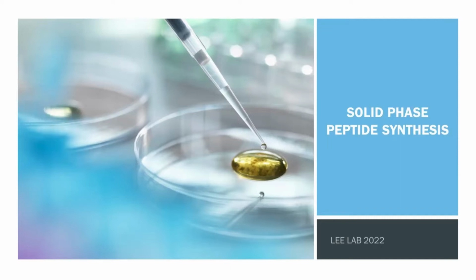Welcome to the solid phase peptide synthesis series made by Dr. Naomi Lee's research group at Northern Arizona University. In this video, we will describe how to cleave your peptide from the resin and the side chain protecting groups.